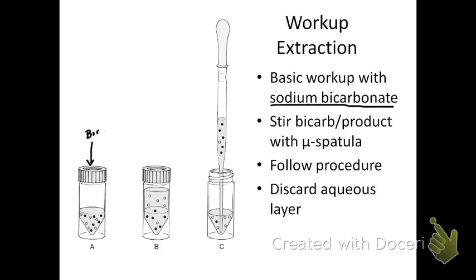The bicarbonate solution is predominantly water; it's only usually about 5% bicarbonate. What's going to happen is that two layers will form in the solution. The organic layer is the top layer, and the aqueous layer is the lower layer.